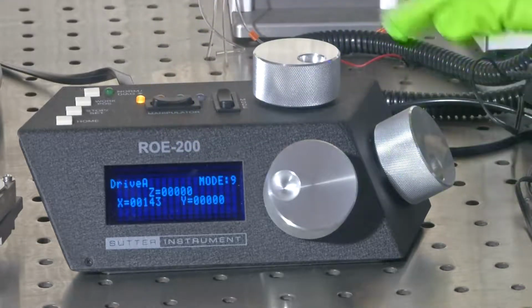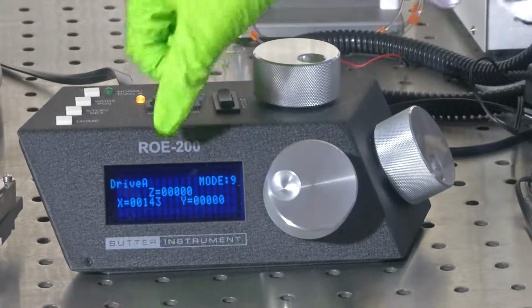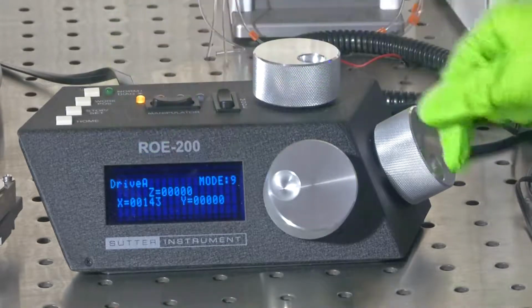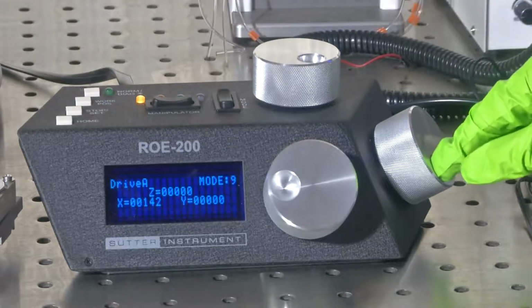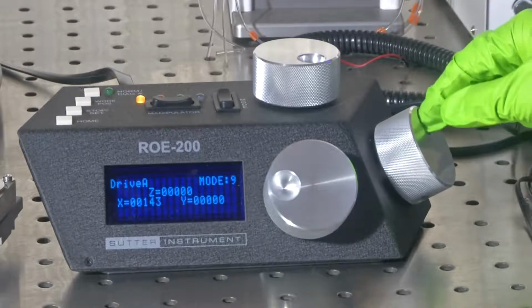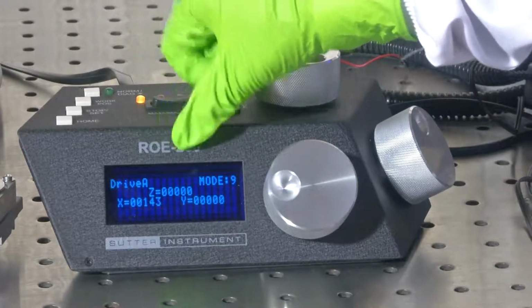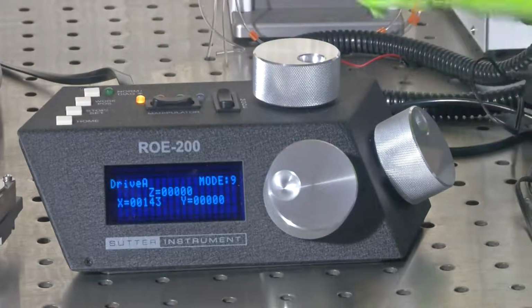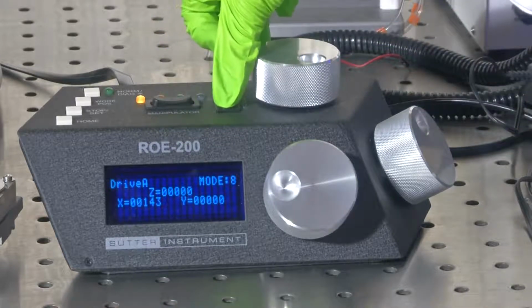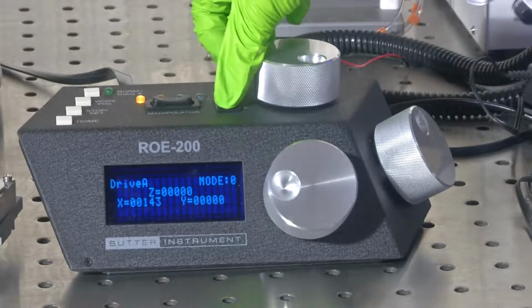So, the entire circle facilitates you to give this 1 micron change in your distance. So, this can give you more precise control over the distance manipulation of your stage. There are intermediate stages which can be explored for different purposes.